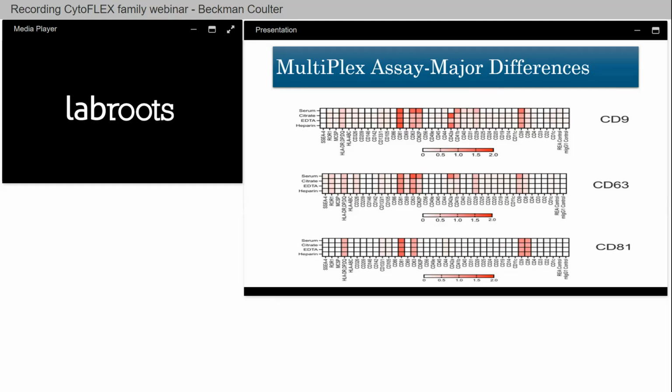Now, a lot of this is not to scare people and say, oh, don't do this, don't do that. It's more to get you to think about it, and to keep repeatability, right? So if you do something, do the same. Don't change between tubes. Don't try different needles. Don't try collecting at different times. Don't collect specimens from someone who just had a huge lunch compared to someone who is fasting for a blood test, as an example.